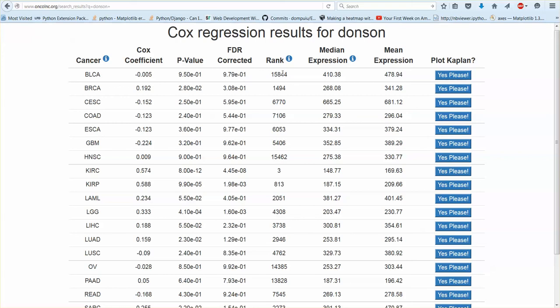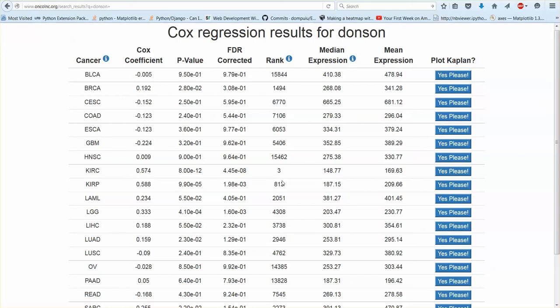Same with the rank. It's a per row rank. So this gene is the third most correlated gene to survival in KIRC.